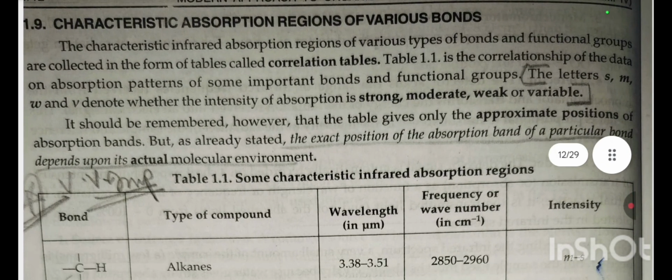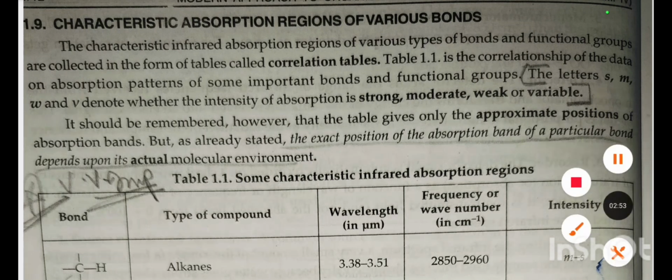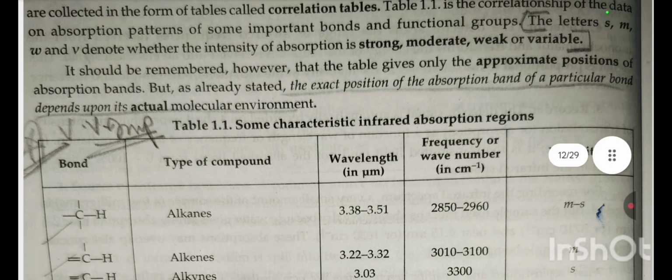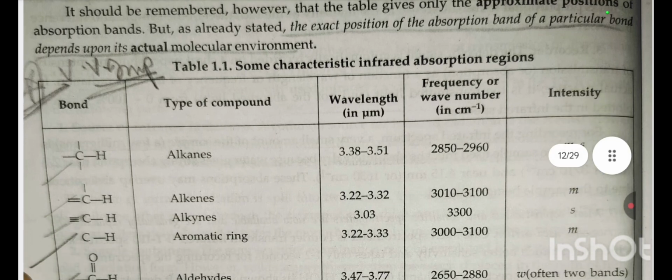Characteristic absorption regions of various bonds. The characteristic infrared absorptions of different regions of various types of bonds and functional groups are collected in the form of tables called correlation tables. The correlation of the data on absorption patterns of some important bonds and functional groups. The letters S, M, W, V denote the intensity is strong, moderate, weak, or variable. It is to be remembered that the table gives the approximate position of absorption bands, but as already stated, the exact position of the absorption band of a particular bond depends upon the actual molecular environment.